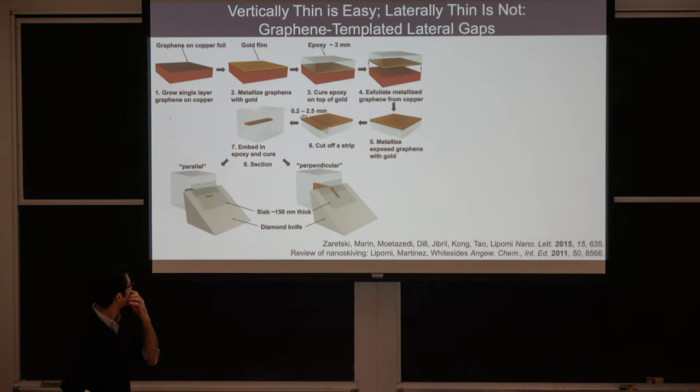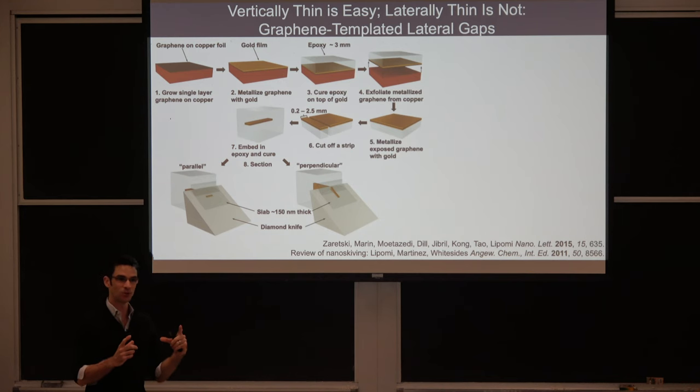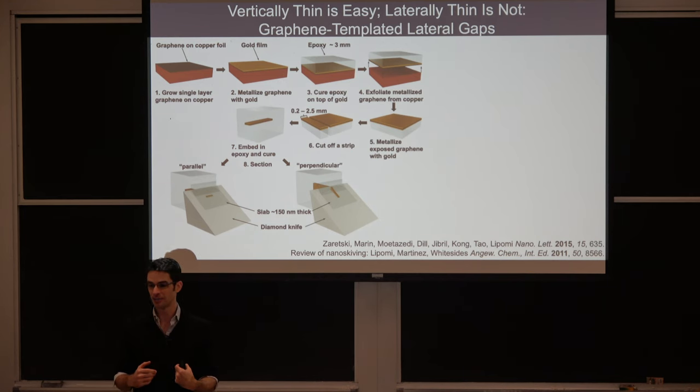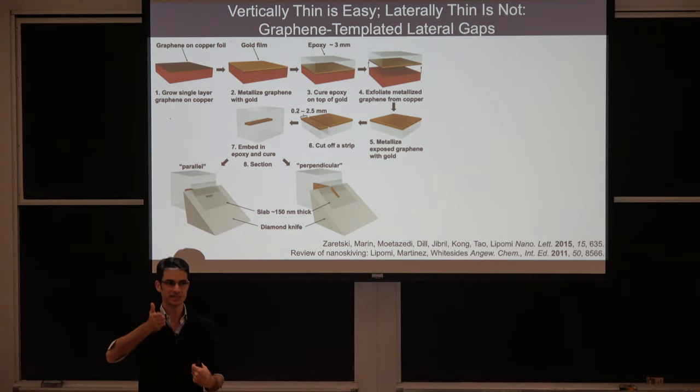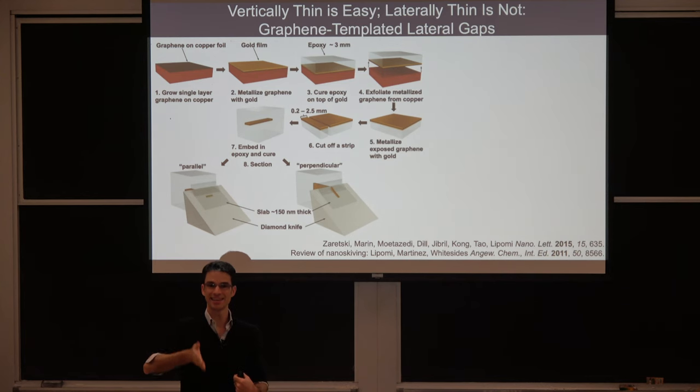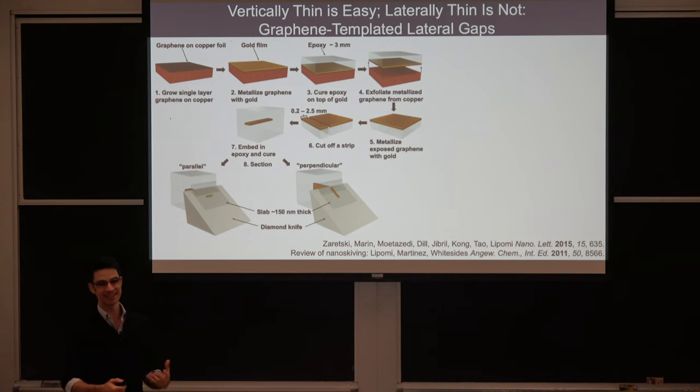Well, there's a tool called an ultramicrotome, which is a tool that's used for preparing samples for electron microscopy. It uses a single crystal diamond blade that is processed to a 2 nanometer radius of curvature and can slice through anything and make very, very thin sections. So it's almost like a deli slicer, but it works on the nanoscale.